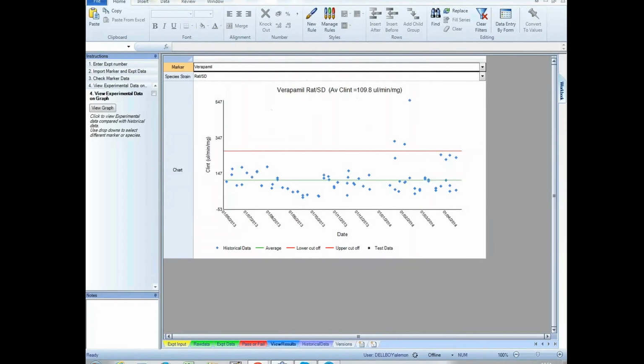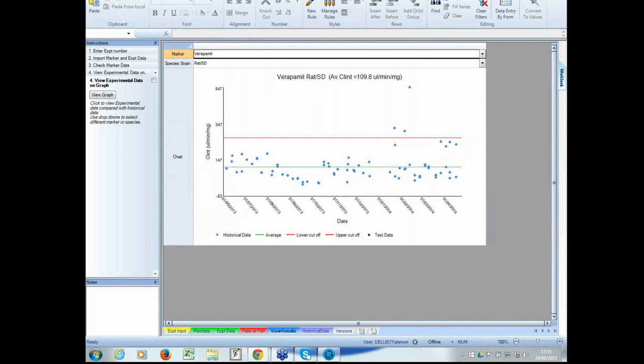The next question, can you monitor controls from different experiments? Yes, so I saw that question. I pulled up this binder here. So this is another example. This is a microsome stability binder. It's fully integrated with BioRails in this case. And what this binder does is it's a metrics binder.